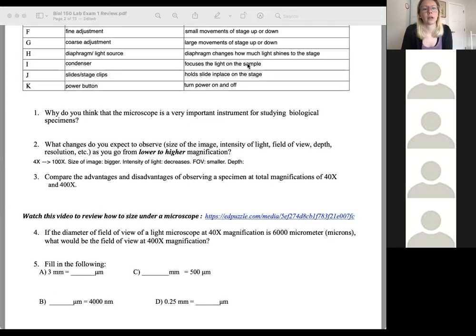Is it going to decrease because it's increasing the specimen, only showing the higher resolution? Yeah, it's going to decrease. You're exactly right. The depth you're able to see decreases because you're zooming in, so you're not going to be able to see as much in that dimension, in that plane of space, basically.